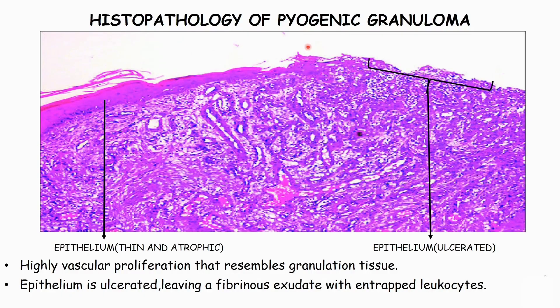Histopathology of pyogenic granuloma. The microscopic examination of pyogenic granuloma shows highly vascular proliferation that resembles granulation tissue. The epithelium overlying the surface is usually ulcerated, leaving a fibrinous exudate with entrapped leukocytes.